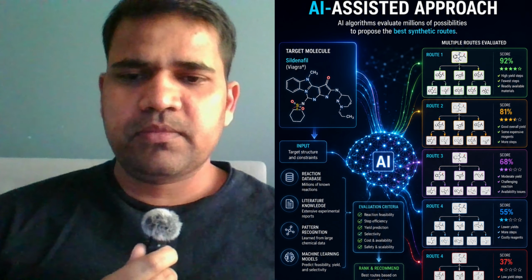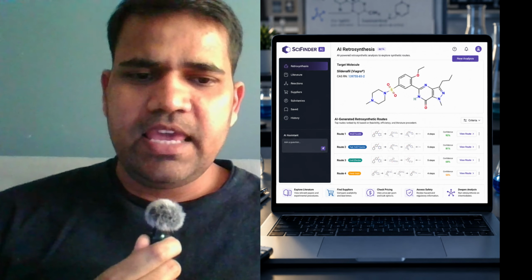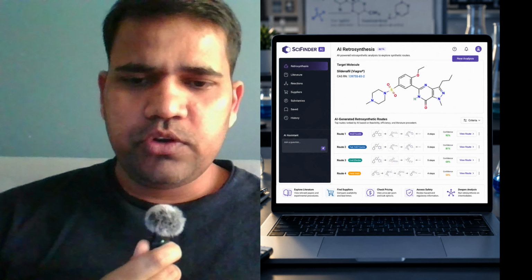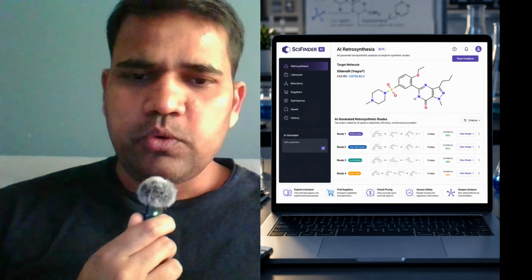much faster. Yes, in this video I'm going to show you how SciFinder uses AI and reaction prediction algorithms to assist chemists in retrosynthetic analysis. So let's start this video.